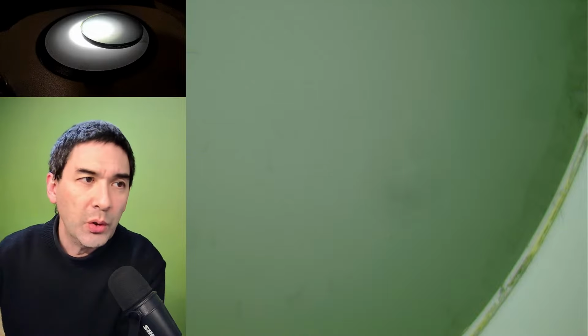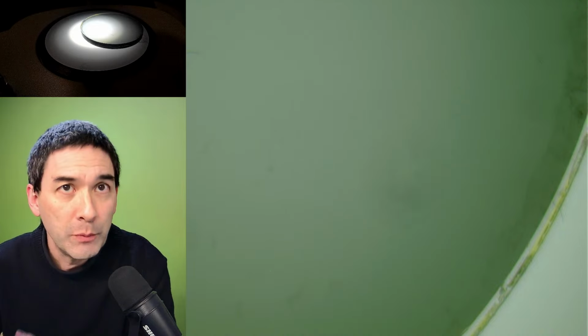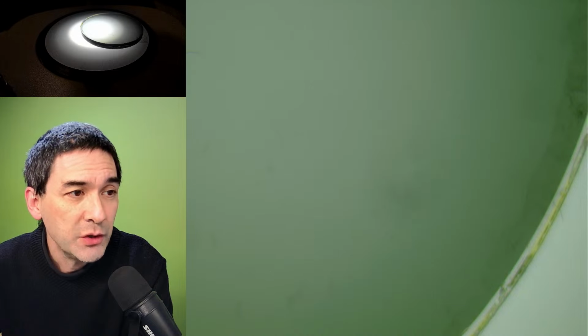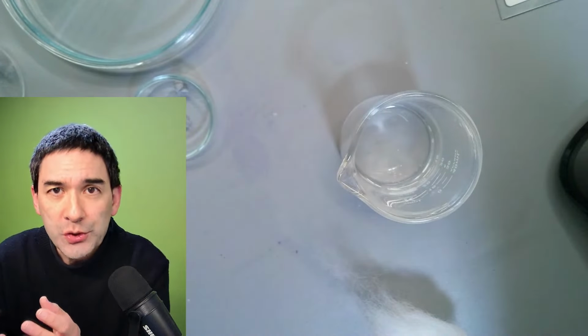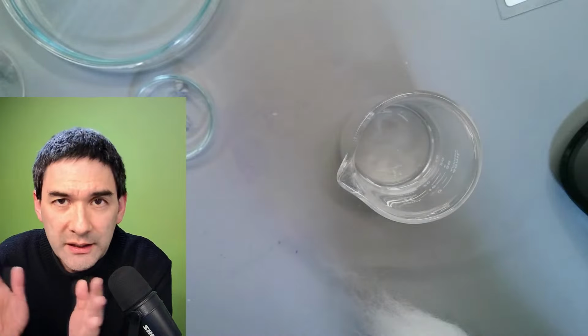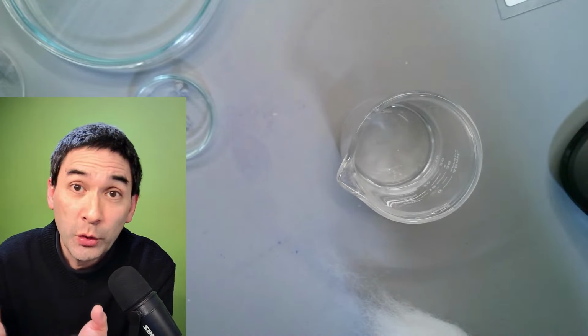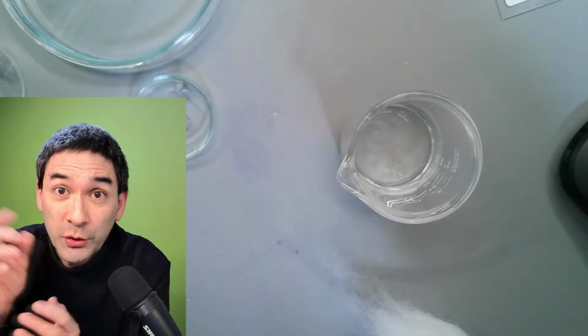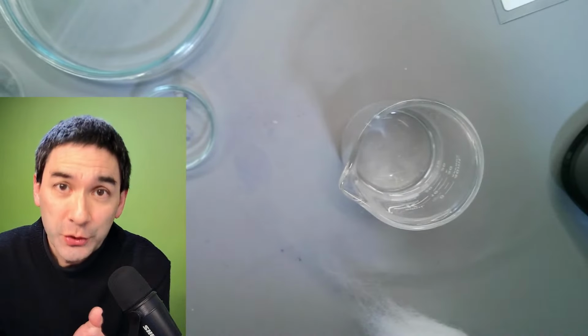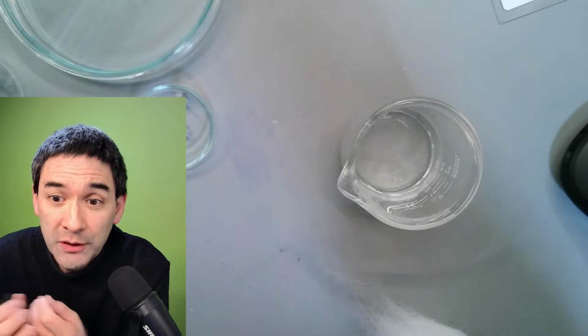Those fibers are so common these days, also in dust and so on, also being a natural part of the environment, that they can be really annoying when you're doing microscopy and then you see those fibers. People actually already posted online and sent me emails. They, for example, observed their own blood sample under the microscope and they saw those fibers and they were kind of worried that this is in their blood, but it's not, right? It's just basically a contaminant on the microscope slide.